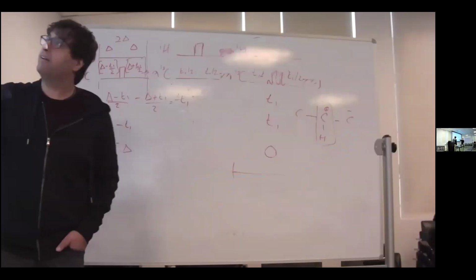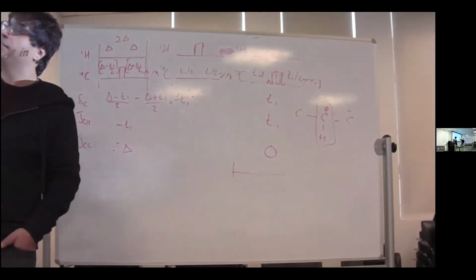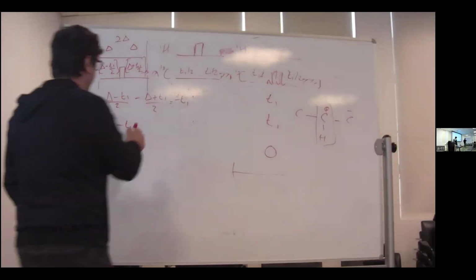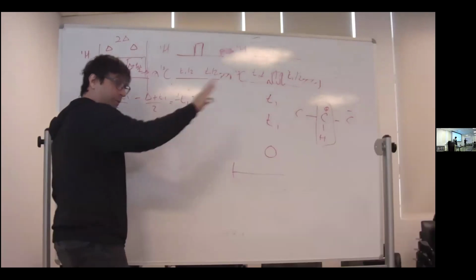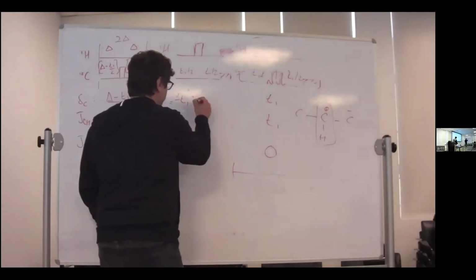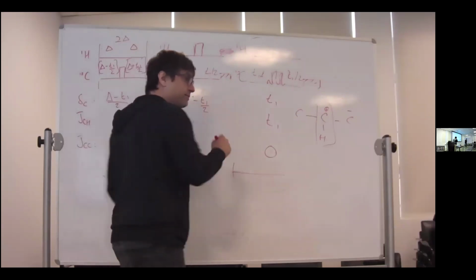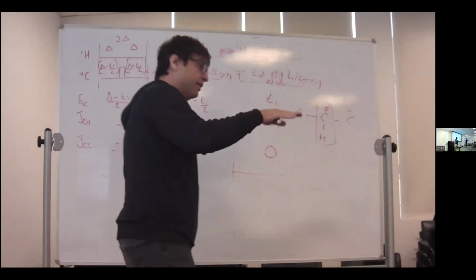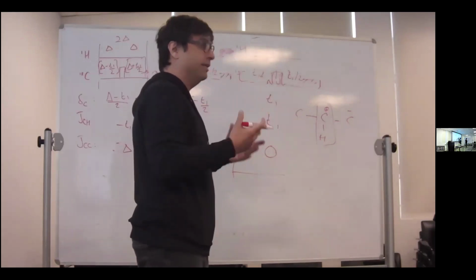And now what is going on later? Let's continue. So now there's the other half. So I have a little T1/2. Chemical shifts, remember we flipped it? After this 180, we were flipping chemical shifts. So we said minus this, now I have to add a minus T1/2. So I'm going to continue, minus T1/2. And then I have a 180 on proton. So what do I do with this term? Just continue negative, because proton 180 does not affect the carbon chemical shift.